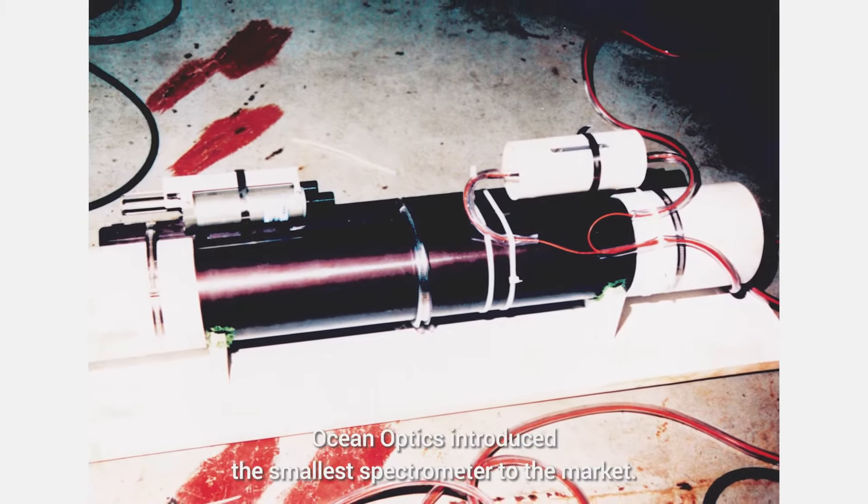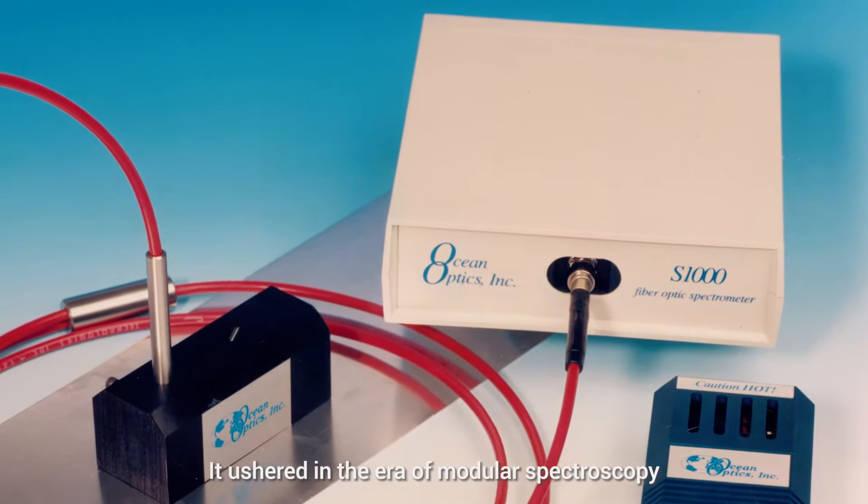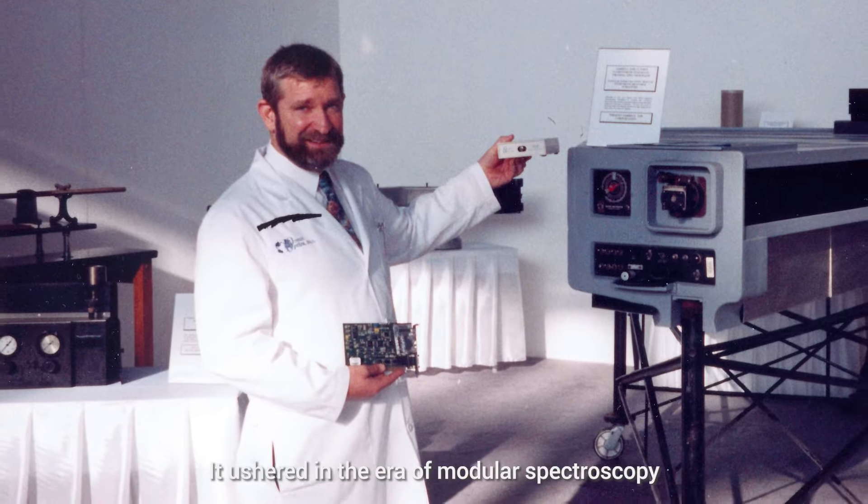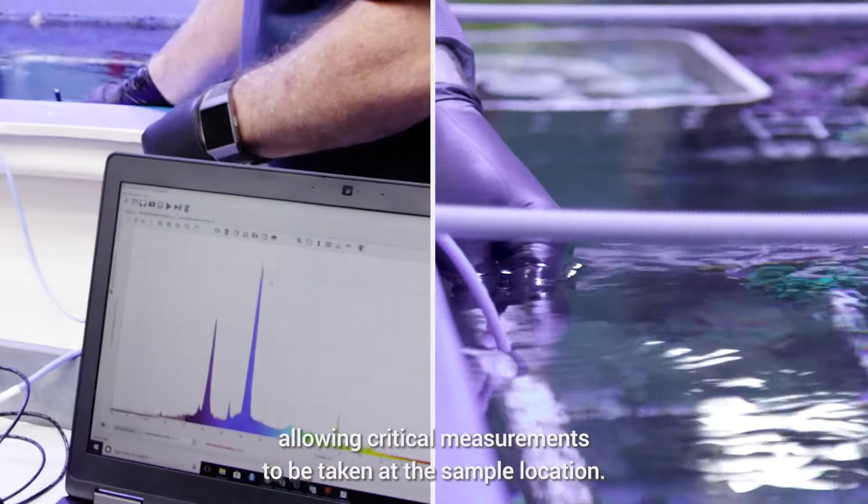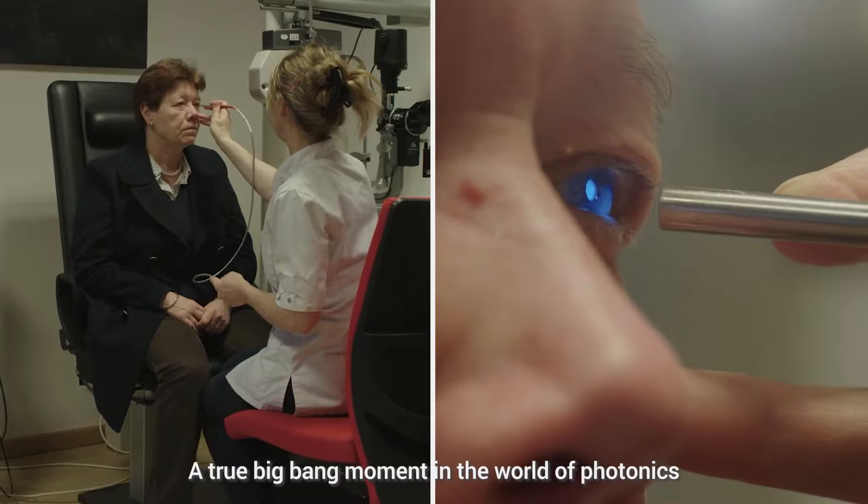Over 30 years ago, OceanOptics introduced the smallest spectrometer to the market. It ushered in the era of modular spectroscopy, allowing critical measurements to be taken at the sample location, a true Big Bang moment in the world of photonics.